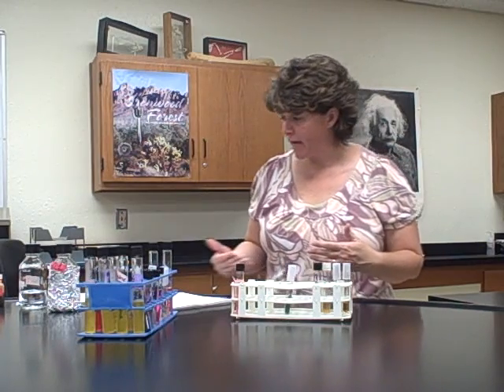This is the second half of fermentation of carbohydrates. What I'm doing is separating these into two separate videos because the MRVP test says to allow the bacteria to inoculate for 48 hours or more, and it hasn't been quite 48 hours, so I'm going to let them go longer. I'm going to do this part first, and then there'll be a second video with the MRVP demonstration. Okay? So let's go back to the first part.